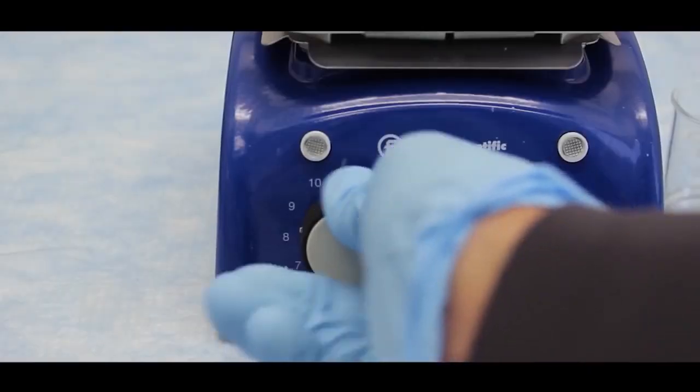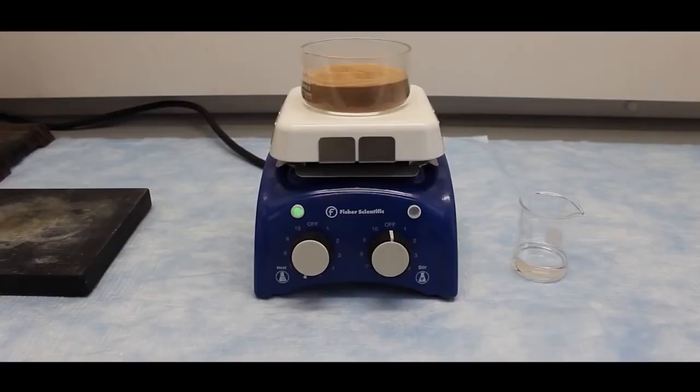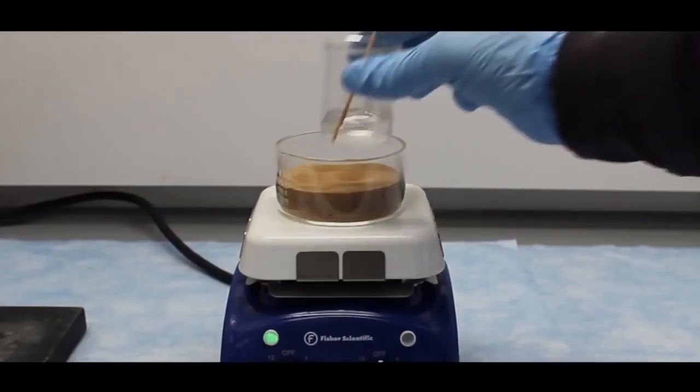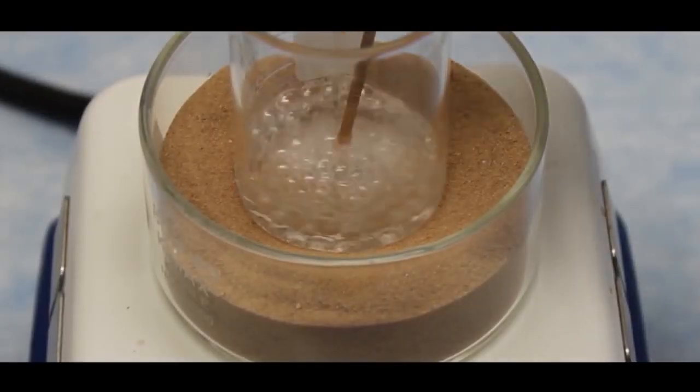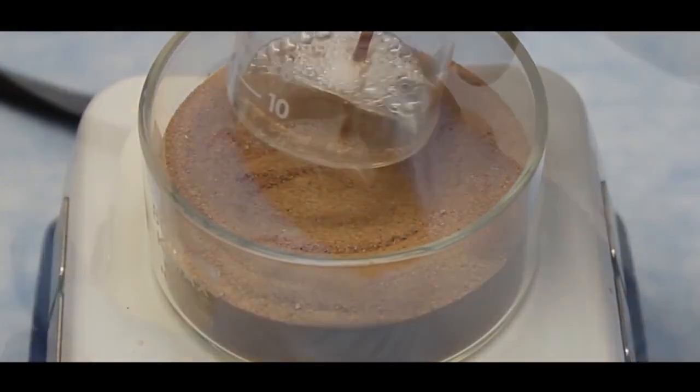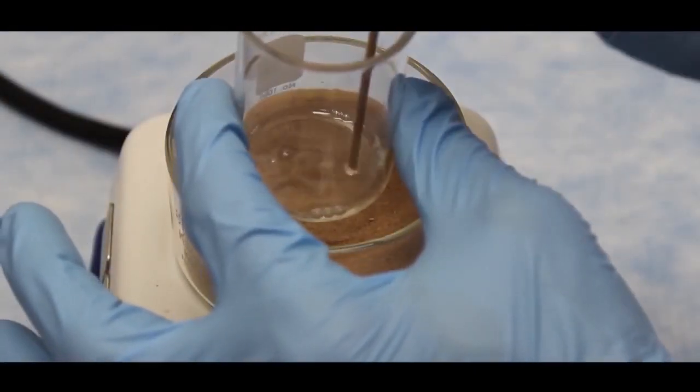Next, I will evaporate the DCM solution on a hot plate in a sand bath. Instead of a boiling chip, I will add a wood applicator stick. DCM has a low boiling point at 40 degrees Celsius. To prevent burning the solution when there is only a little bit of it left, I will make sure it is no longer in direct contact with the sand.